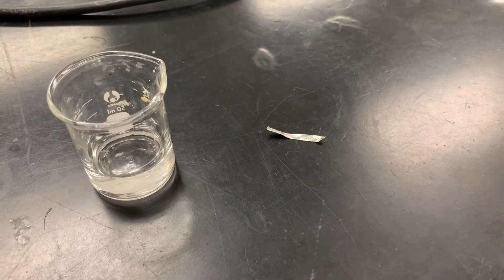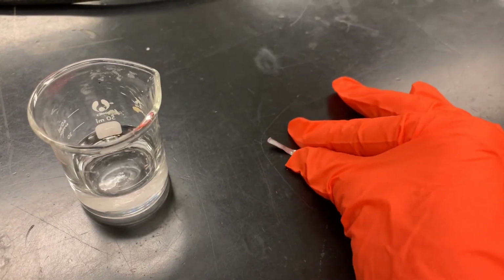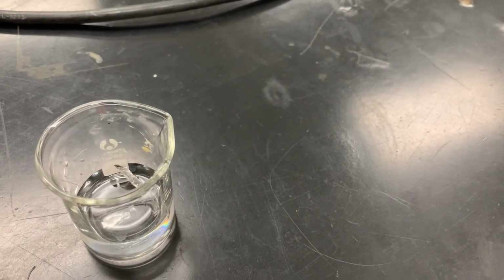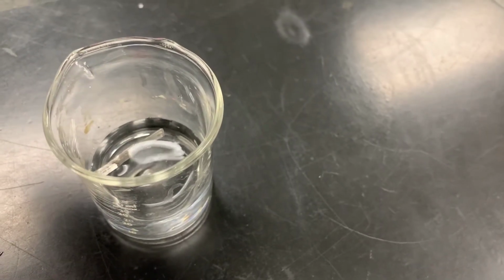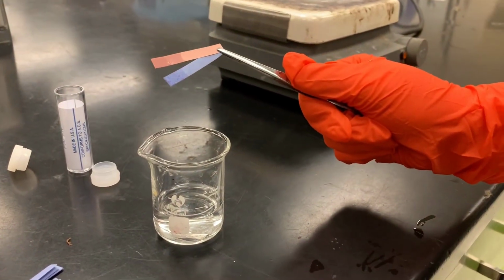So our next representative alkaline earth metal is a piece of magnesium ribbon, and we've seen this before. It's silver, lustrous, malleable. Okay, we're going to drop that into some water, and we notice there's no reaction, right? And we can see that our litmus paper doesn't turn.